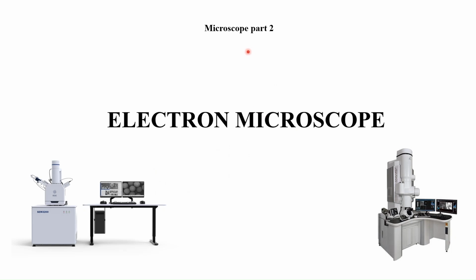Microscope class part 2, Electron Microscope. In this session, we will discuss the electron microscope, such as the scanning electron microscope and the transmission electron microscope, and their working principle and functions.